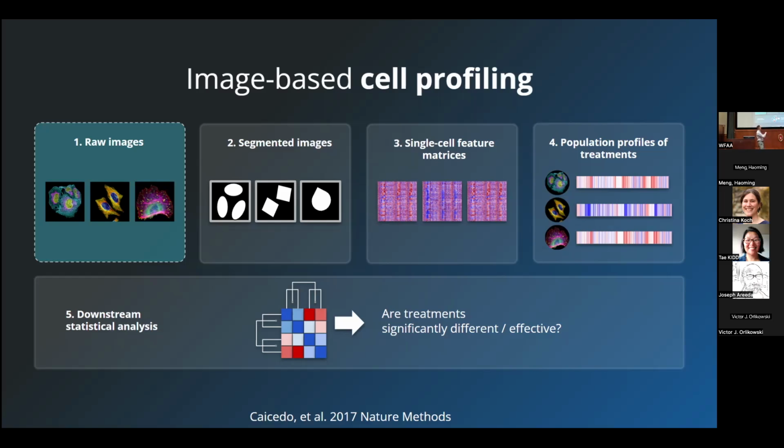So in this case, we want to identify where the cells are in one biological experiment. After doing this, we can create matrices that characterize the structure of every single cell in the experiment. These matrices have single cells in the rows, and then a bunch of properties of those cells in the columns. And that is the process of feature extraction.